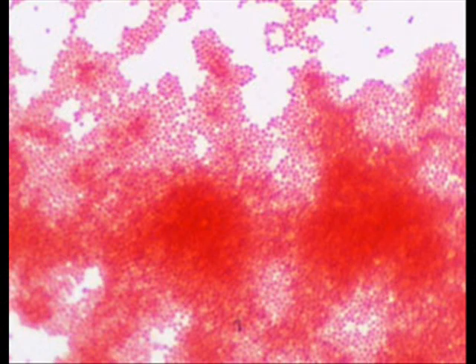The bacterial smear on the right is my non-endospore producer, which would be my negative control. In this case I used Staphylococcus. Here's what my negative control looks like under the scope. This is Staphylococcus epidermidis — it does not produce endospores, so I see only pink vegetative cells.